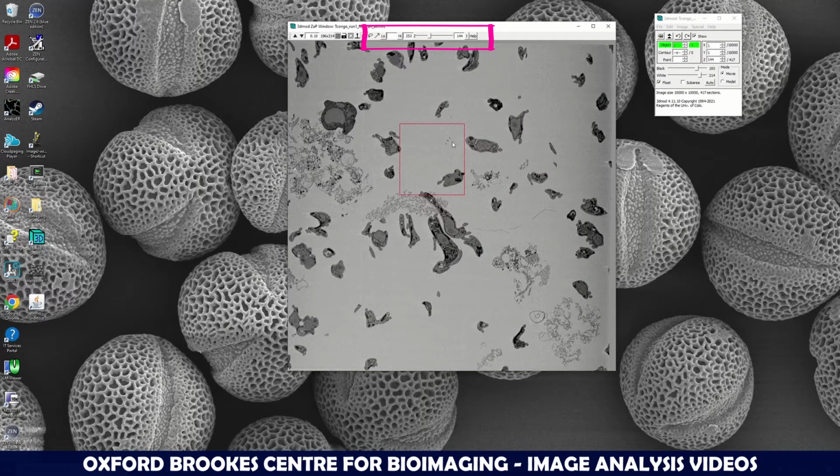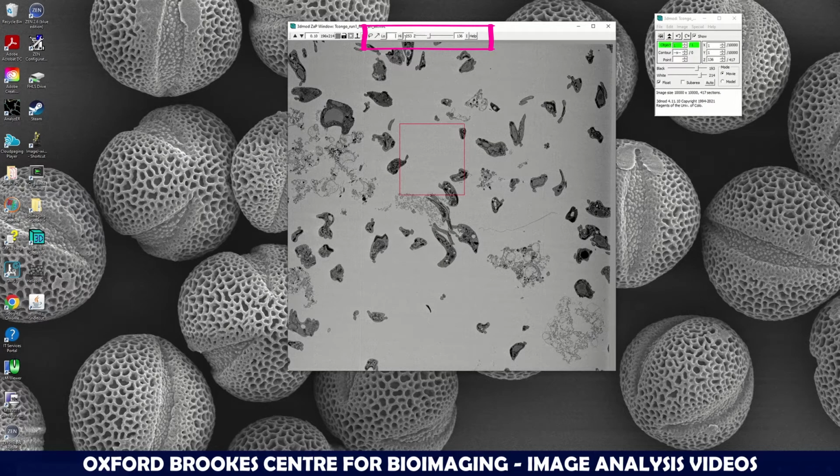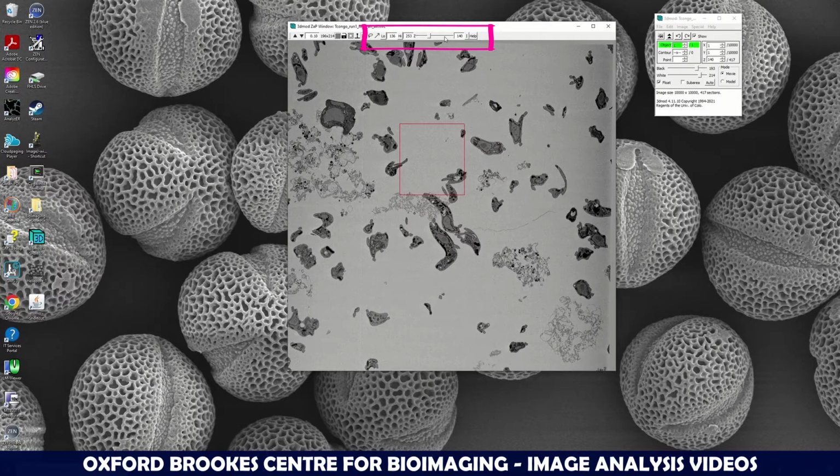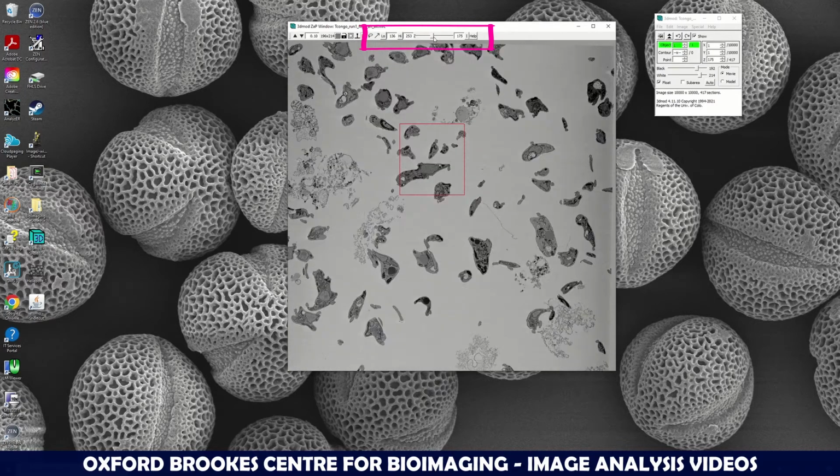So this is the end of my cell of interest, and in, I think, 136 there's no sign of it anymore. So I think Z 136 to 253 covers my cell of interest.